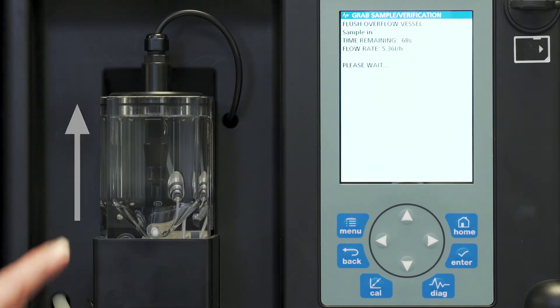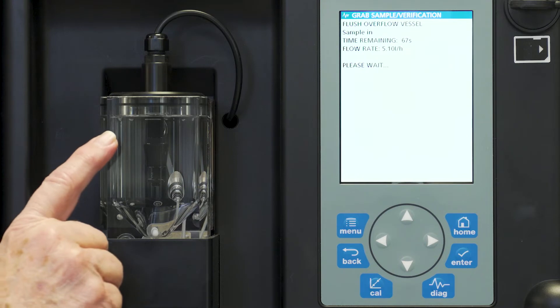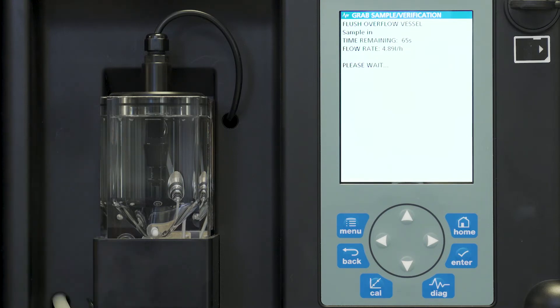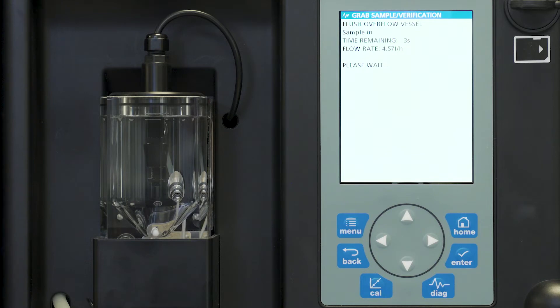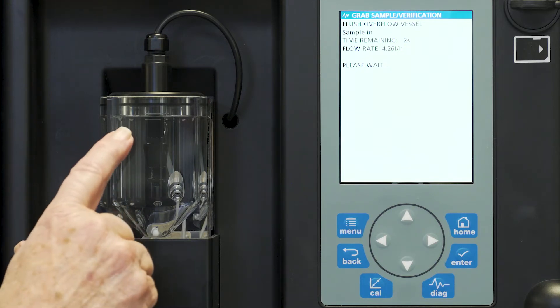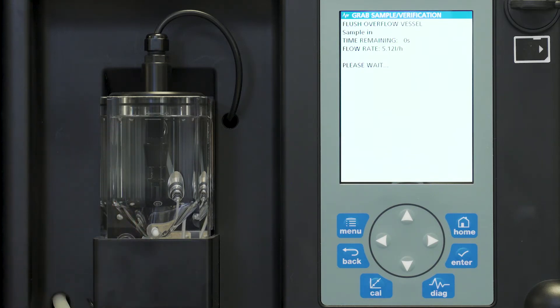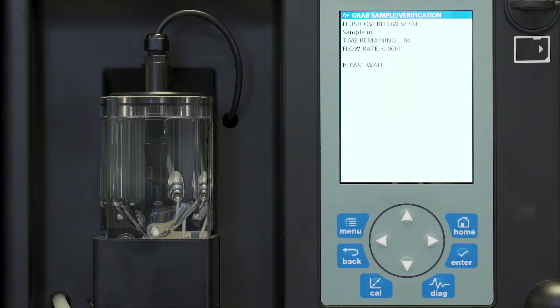You will notice now that the overflow chamber has completely filled. So now we're finishing up this final rinse. This sample will now drain out of the overflow cell to prepare us to add our actual sample.